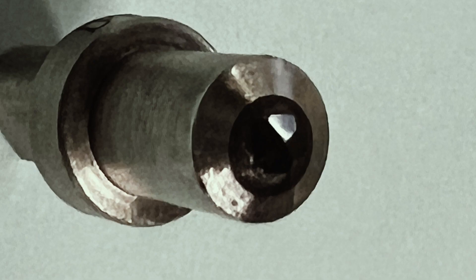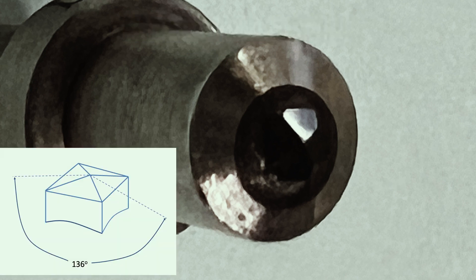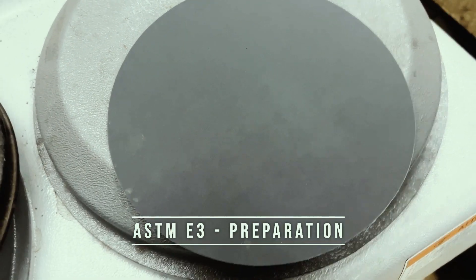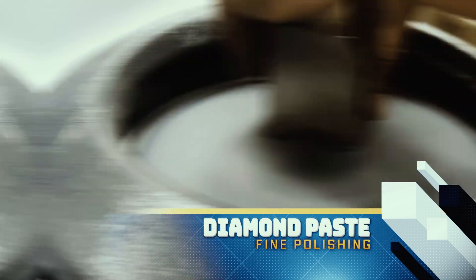The indenter is a square-based pyramidal diamond with face angles of 136 degrees. The preparation follows ASTM E3, where fine polishing is carried out with diamond paste. This will make it easier to measure the indentation under the camera.